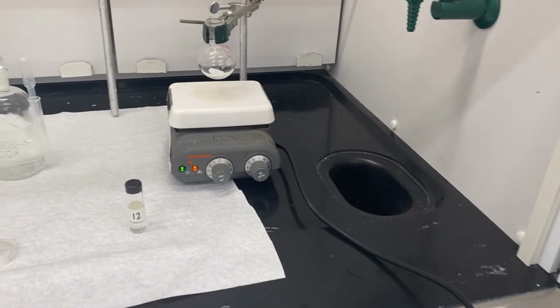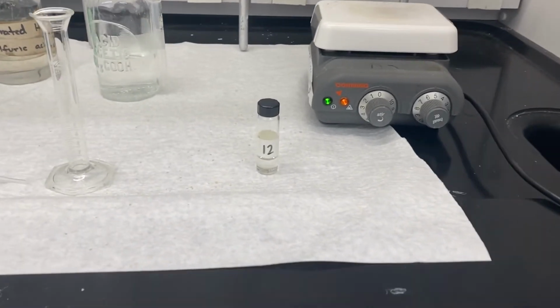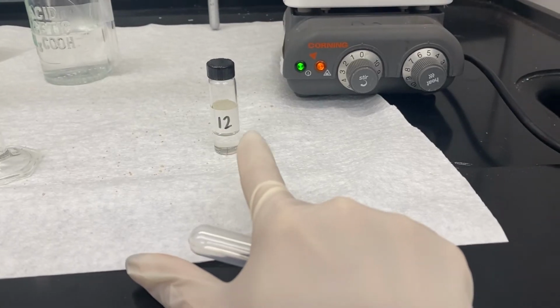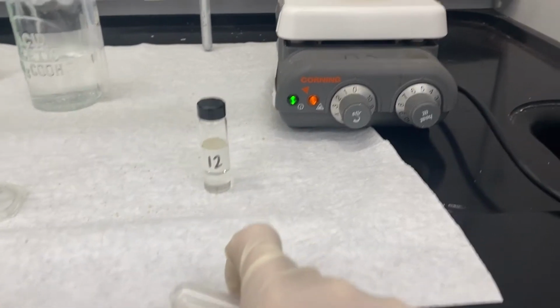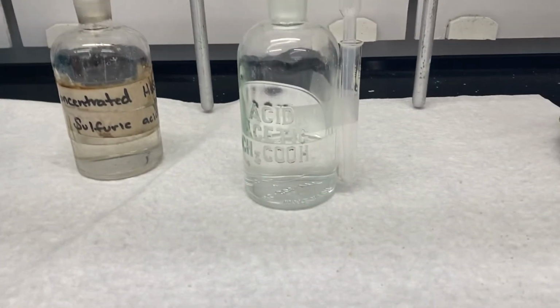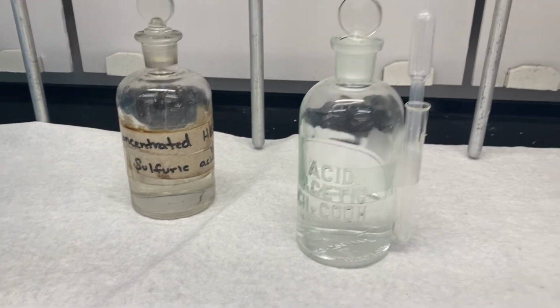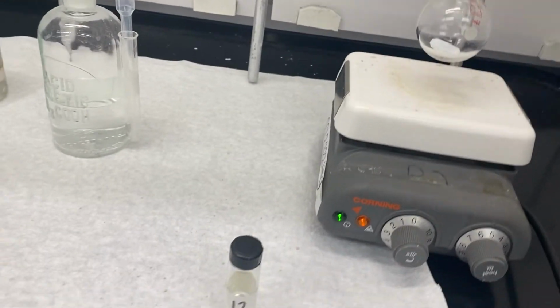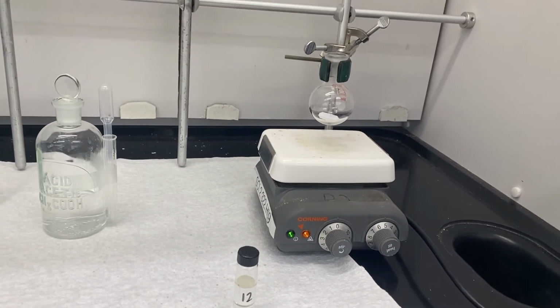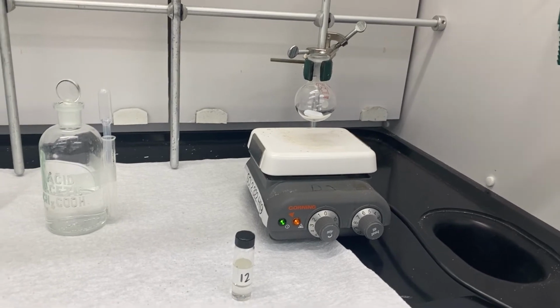Was it propyl alcohol, benzyl alcohol, or the isopentyl alcohol? All right, so we'll start the experiment. This is our Fischer Esterification. We have our unknown 12, so we don't know what alcohol this is. We'll just record that it's alcohol number 12. And we're going to do this under acidic conditions. So we have our acetic acid and our concentrated sulfuric acid. So we're going to mix all of these things together, and we're going to reflux the solution so that it has a chance to react over the course of an hour.